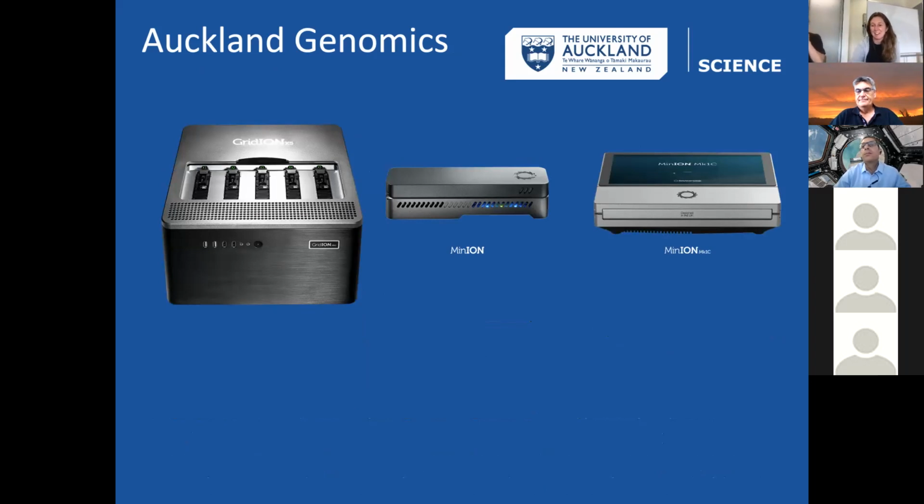Kia ora. So yes, I just wanted really to pick up on some of the main use cases that we have here, just to highlight some of the things that people in Auckland are doing with Nanopore sequencing. And some of the questions that we get asked around how to scope these projects out or what to expect from them. So just really picking up our main use cases, but as Warren has said, there is a real diversity of things that you can do with this technology.